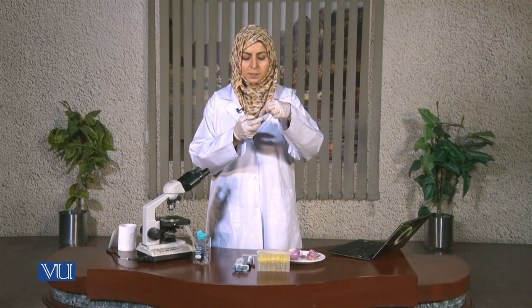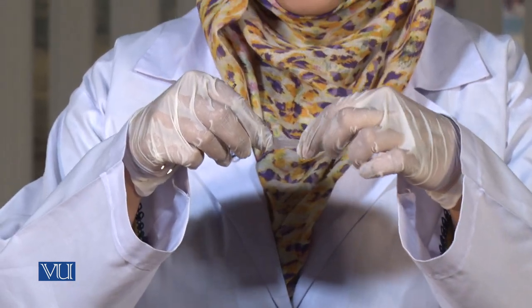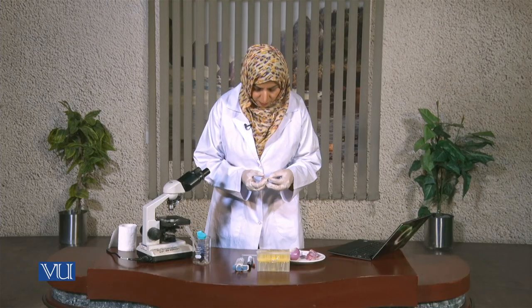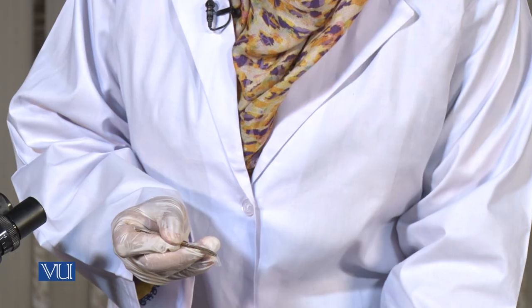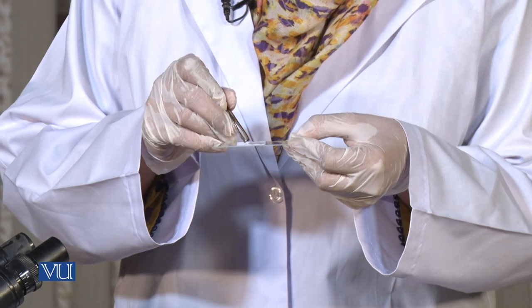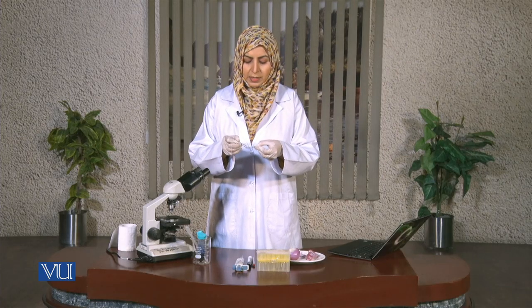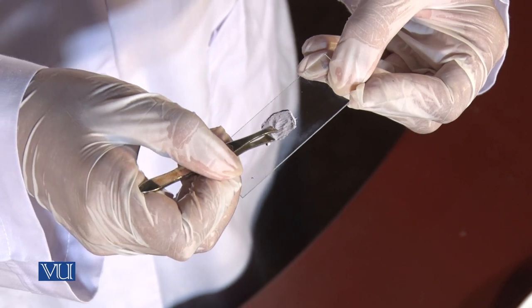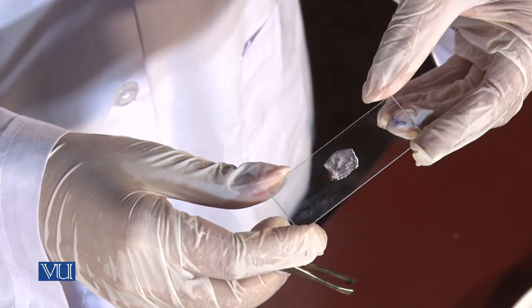Now I've got a piece of it and I'm going to cut it into a smaller one and put it on the slide. I'll place it on the droplet of water. Try to avoid any kind of wrinkles in it. Then we'll add the stain — methylene blue — on to the slide.